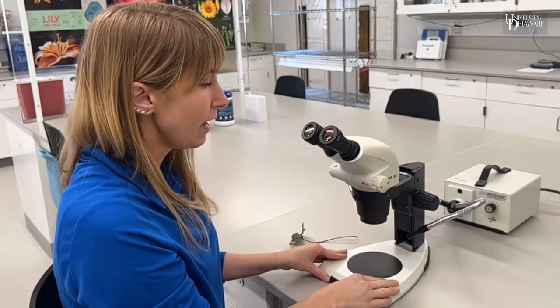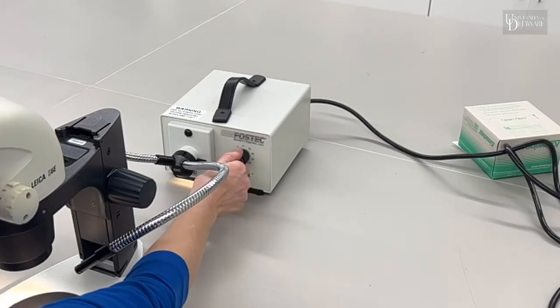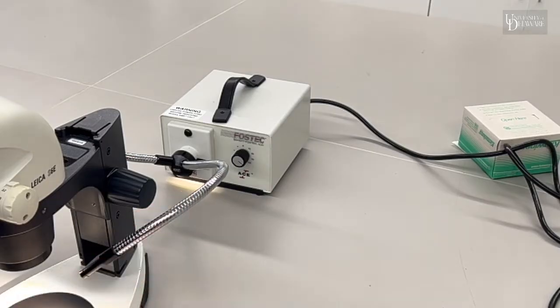Some microscopes have a built-in light source, but this one has an external light source. The first thing you want to do is turn on that light source. I usually like to turn it on all the way, and then just make sure the lights are pointing at the specimen right in the middle of the stage.